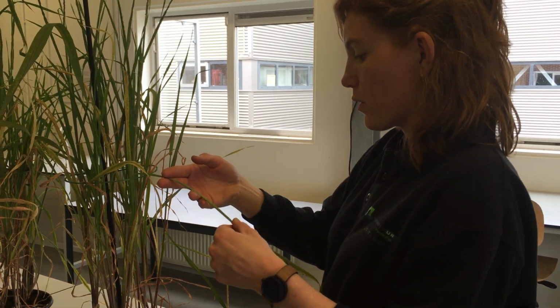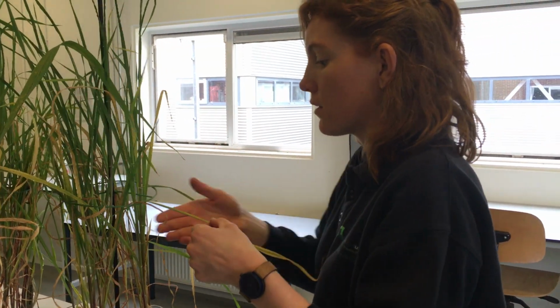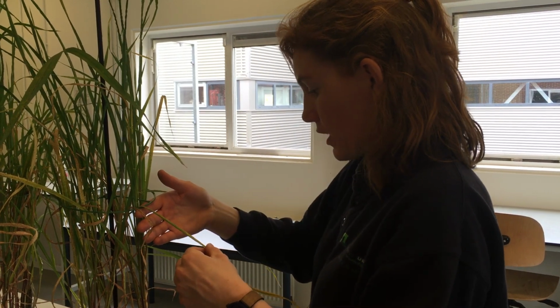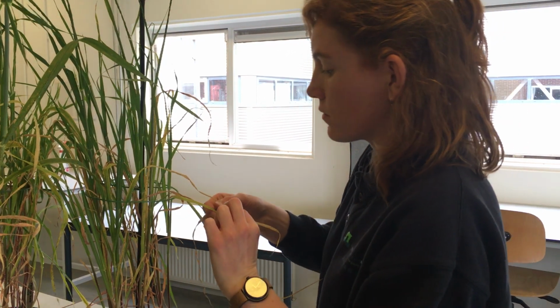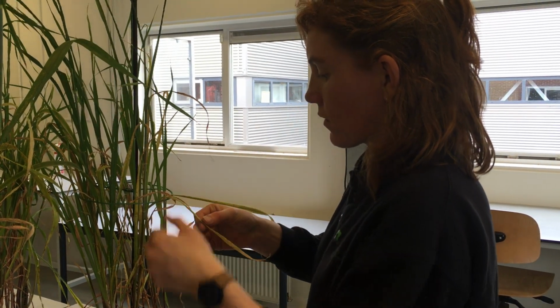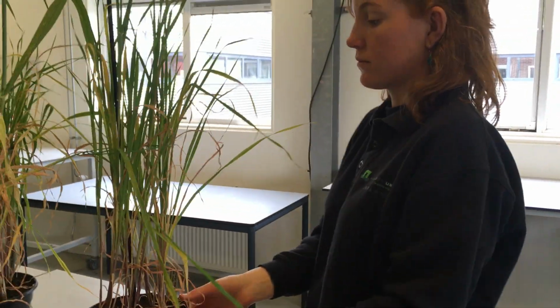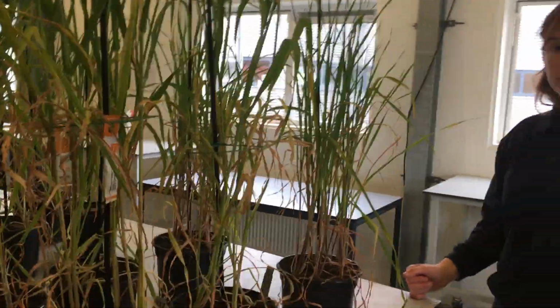This one's a bit more, maybe 50. Another 30. Okay. Yeah, say 30%. Okay, so that's for Fada. So in such a way, we will score all these 5 cultivars.